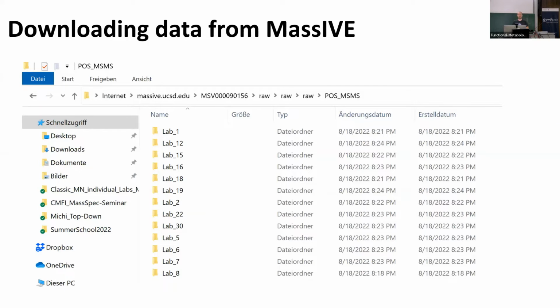Or in your Explorer with Windows, and how's it with Mac? You go to the setup, like file sharing. Okay. Yeah, we can add to these slides to show for Mac. So with Mac, you can basically also just open that FTP link.